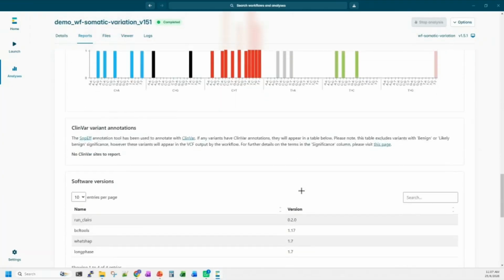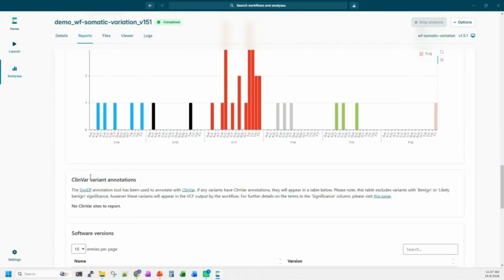Yeah, so this one I'm not going to go into very much detail. I just want to show that the ClinVar annotation is here. Even though ClinVar has not been popular, not really used for somatic variation annotation purposes, I think they have just started to keep the somatic variation information since 1 or 2 years ago. So the information for somatic variations from ClinVar might not be a lot.